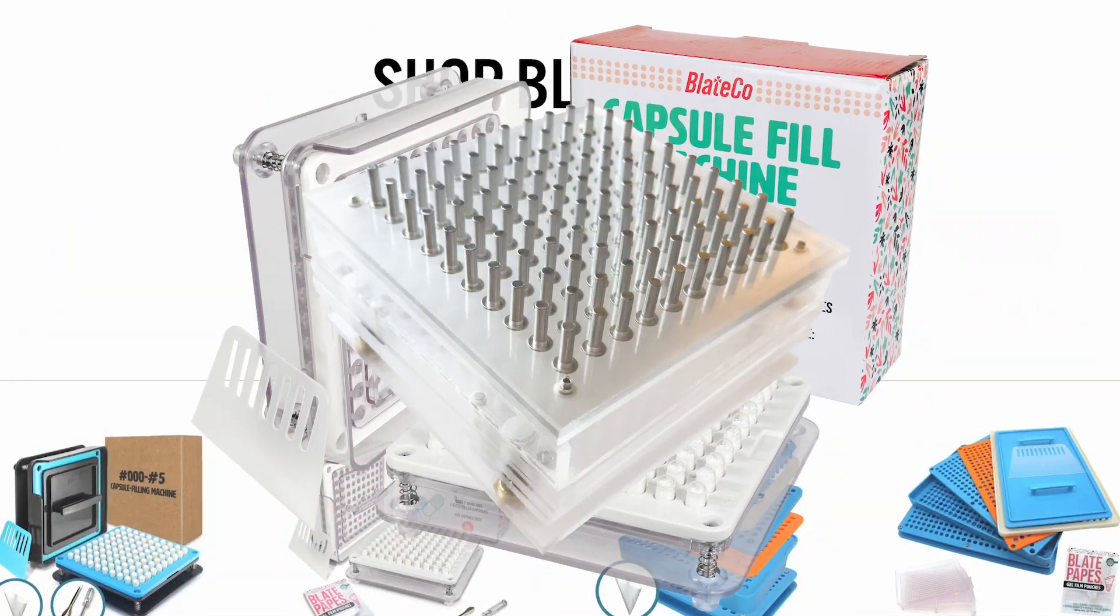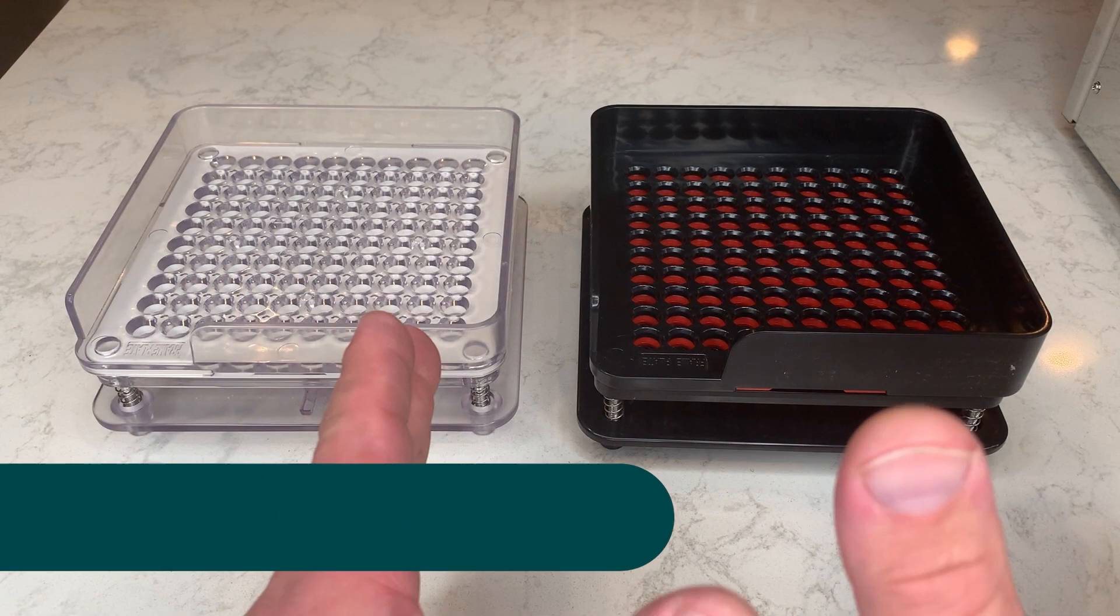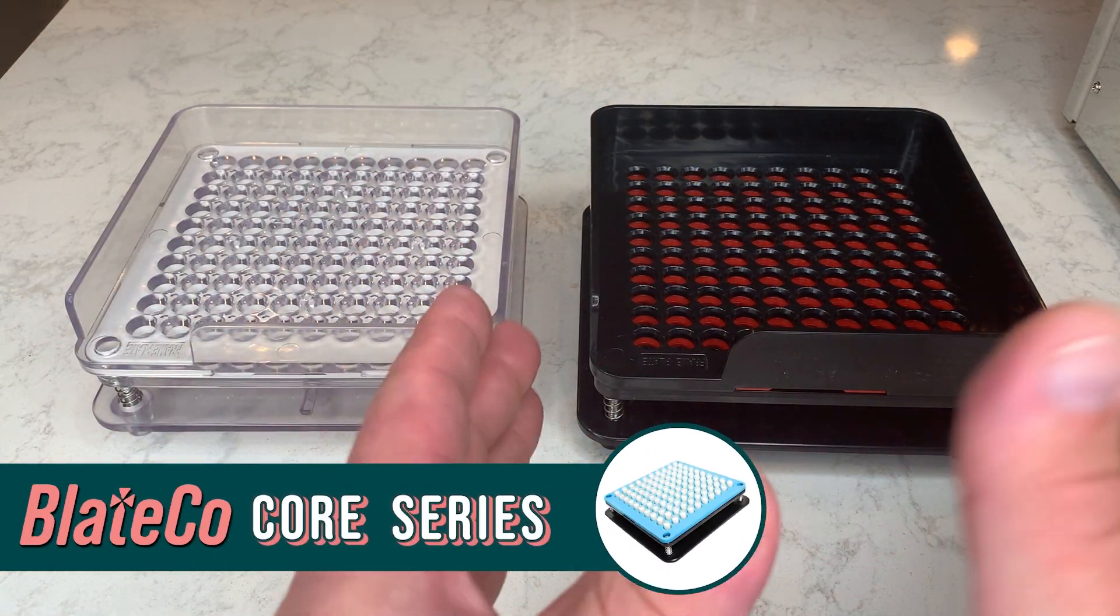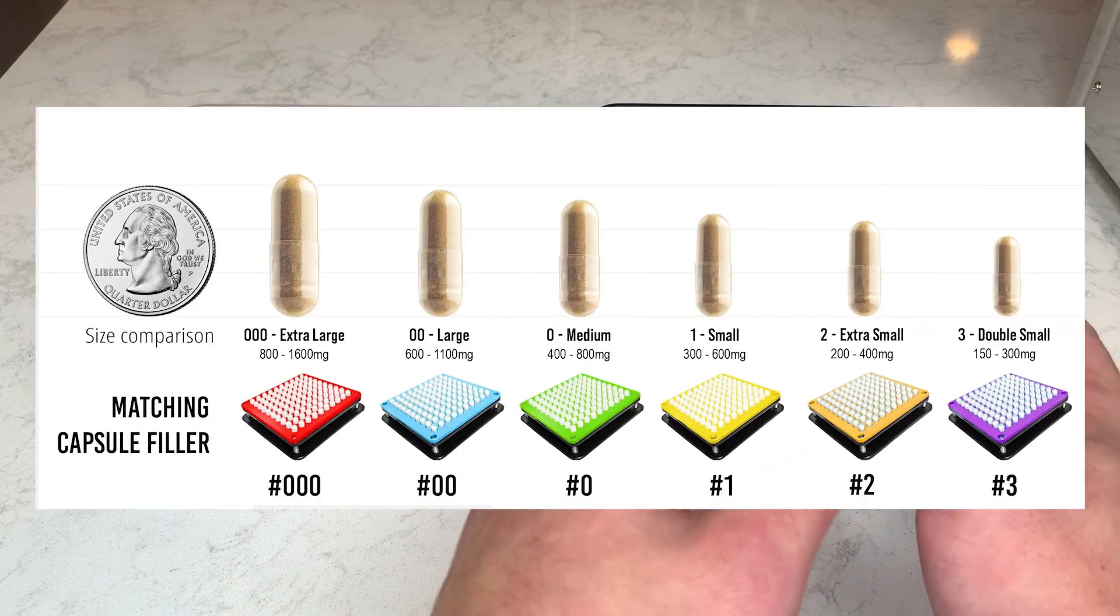You may have noticed we offer more than one type of 100-hole capsule filling machine at BladeCo. Right here, I have the Core Series 100-hole capsule filling machine, which comes in a different color corresponding with each capsule size.